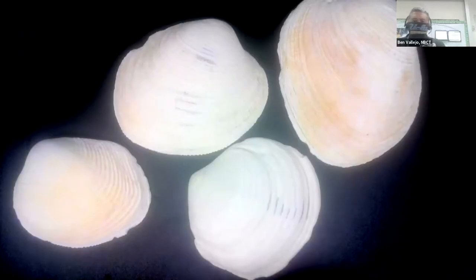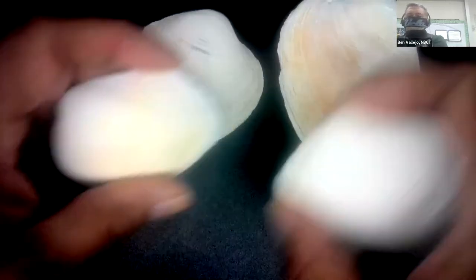Okay, so let me get rid of these for a second, and we'll set up a data table and record our information. It could be something like this. Let's call it clamshell bands. Let me focus that.